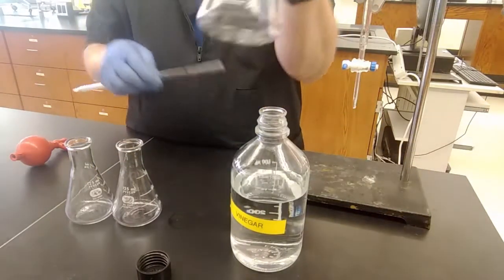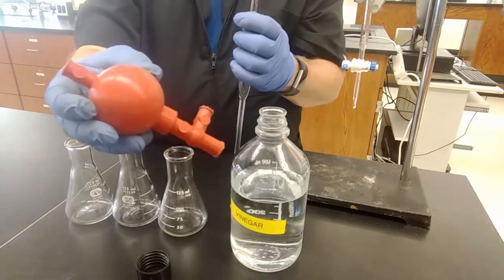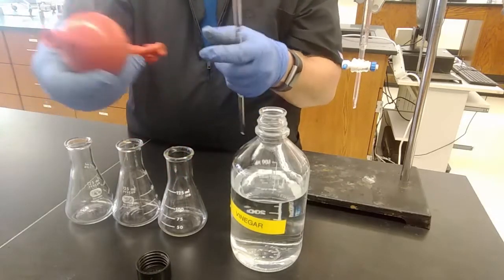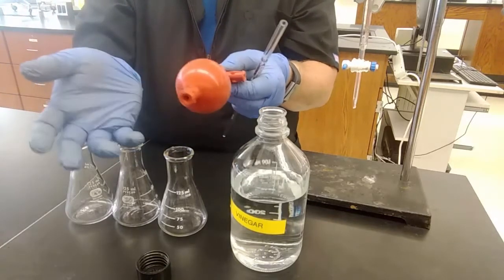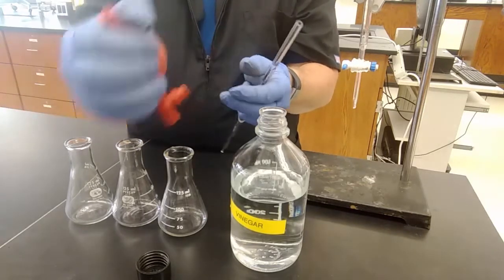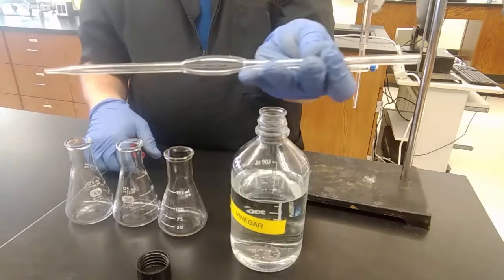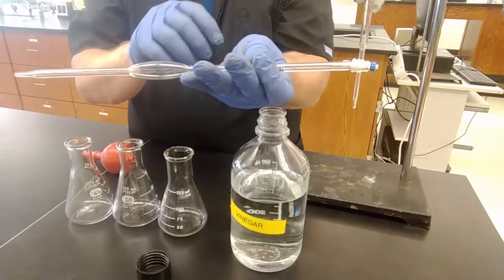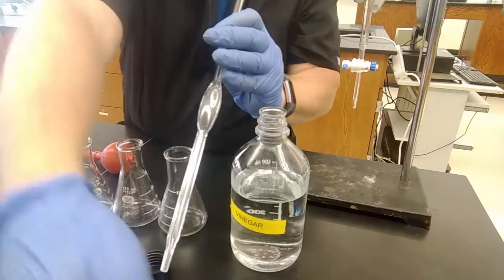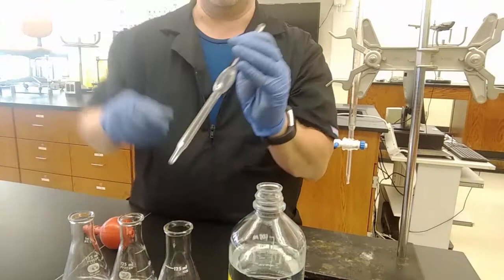We can't just pour 10 milliliters into here. It's not going to work. So the way that we do it is to use a pipette bulb, and these things can get destroyed very easily from people not knowing how to use them properly. It's pretty much relatively straightforward to use. The old school ones had no valves on them, and that's what breaks on these. It was just a rubber bulb, and you squeezed it to blow the air out of it, and then it would suck stuff up in it. In the old school way of pipetting, there was a little hose and a mouthpiece, and you shoved the hose on the end of here, put the other end in your mouth, and sucked it up. That is generally considered to be a big no-no in the lab today.